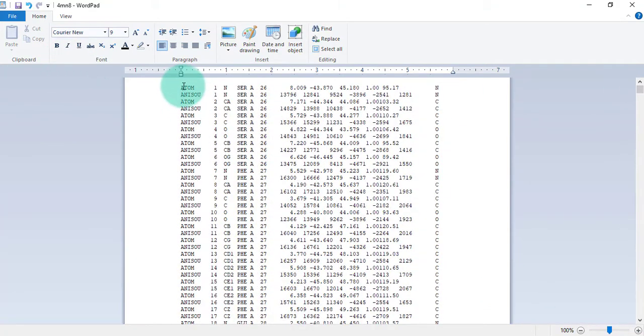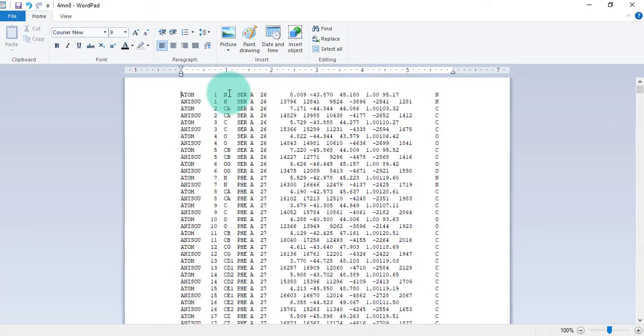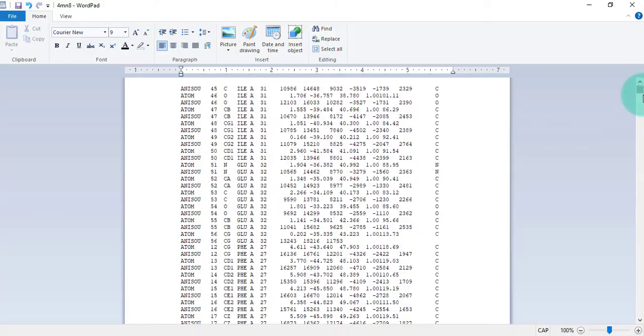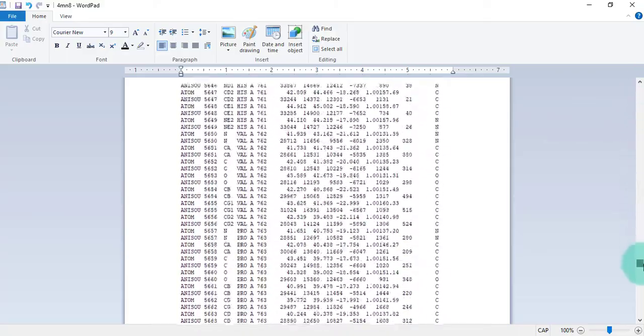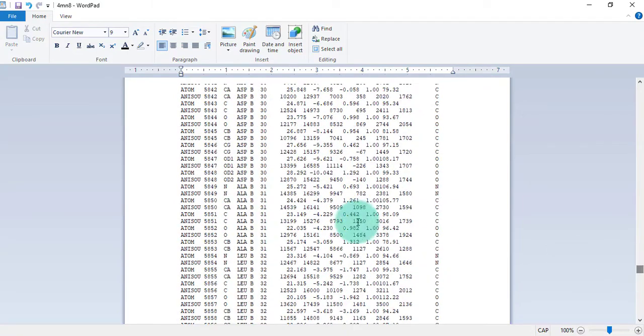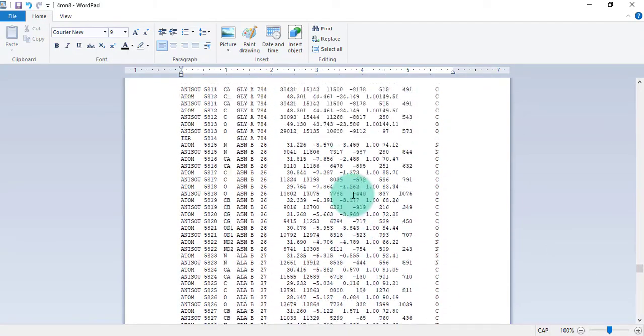Well, the next thing you want to do is give a header for all the cases, and for this let's write HEADER. For this one it is FLS2, we already know, and let's go to the bottom of this FLS2. It was around 780. So let's open this.